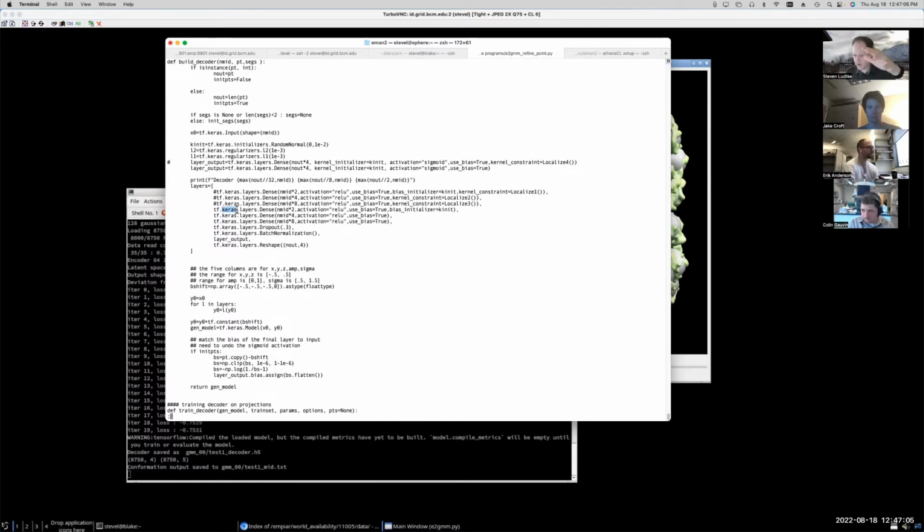Okay, I have another layer and it's this big and it should be fully connected to the previous layer. Okay, I have another layer and it's this big and it should be fully connected to the previous layer, that sort of thing. So you basically define it as a Python list, and inside the list, you put each of these layers that you want to describe. Now, the input that you would use to one of these networks once you create it is going to be a TensorFlow tensor object.